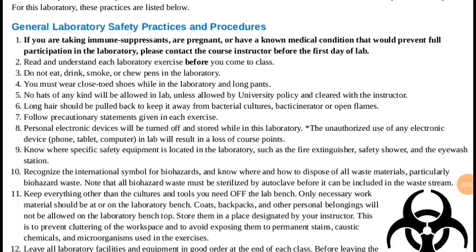The hair should be tied backwards, for those with long hair, and for gentlemen, it's not advisable to wear hats while attending laboratories. Personal electronic devices will be turned off and stored while in this laboratory. Therefore, you should not be using your phones, tablets, or laptops in the lab.